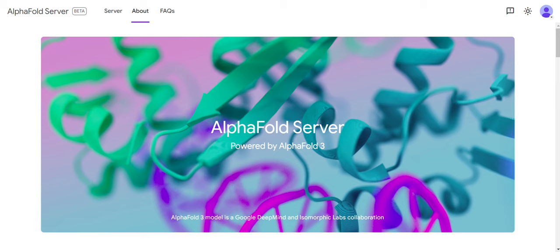We hope that you will be familiar with AlphaFold 2.0. This AlphaFold version has revolutionized structural bioinformatics and greatly expedited biological research, especially the pharmaceutical one. In a previous video tutorial, we explained how you can use AlphaFold 2.0. Now in this video tutorial, we will explain how you can use AlphaFold 3. AlphaFold 3 was released at the start of May 2024 and caught the eyes of researchers. So without any further delay, let's begin this video tutorial and see how you can use AlphaFold 3.